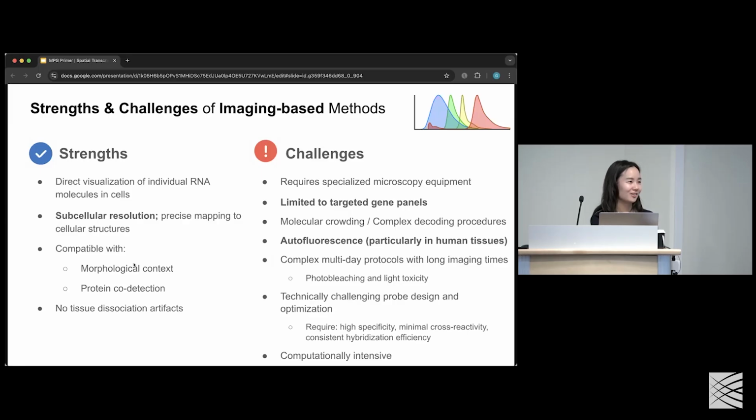I think poly-A RNAs are easy because, regardless of transcript identity, they all have A's. But there are ways to enrich or deplete for specific types of RNAs or sequences that you might be interested in. Most of the technologies start from the poly-A RNAs because it's kind of low-hanging fruit.